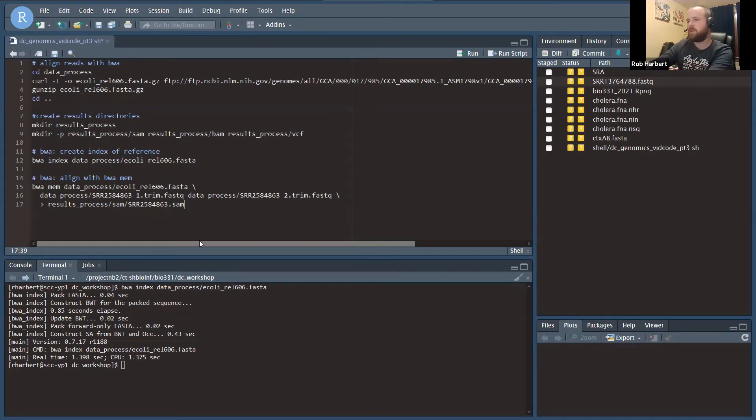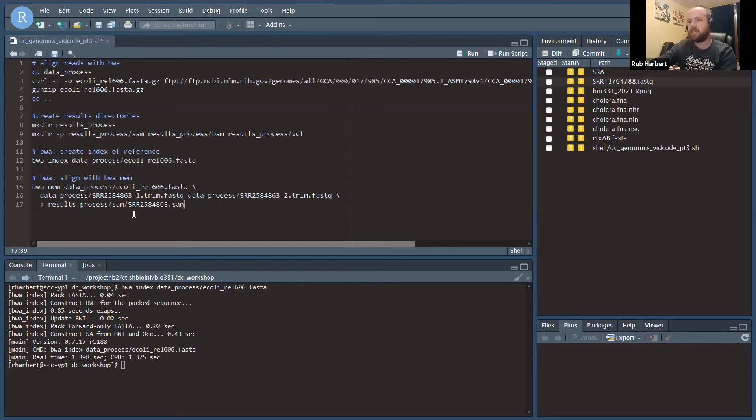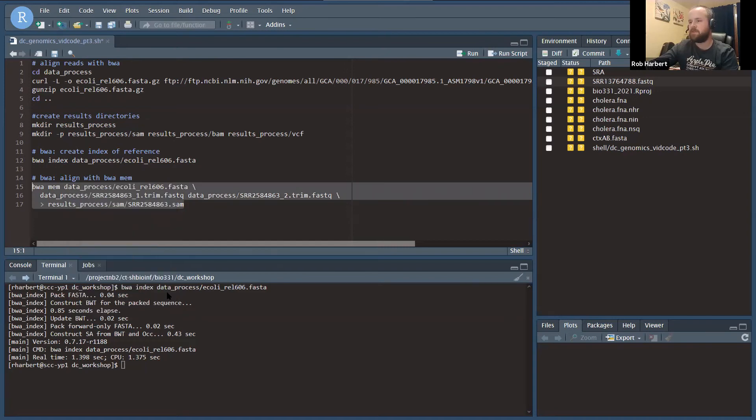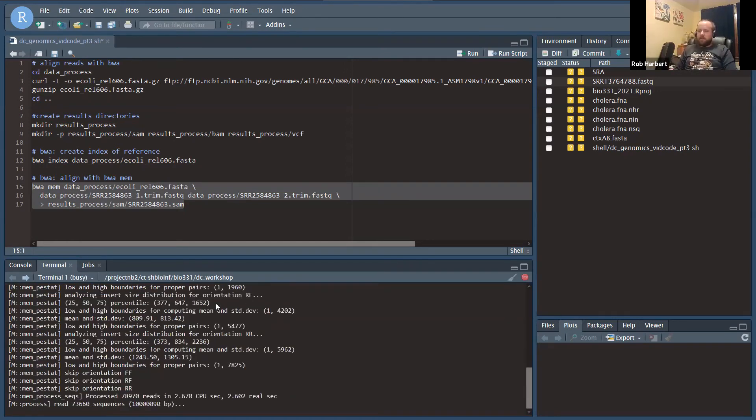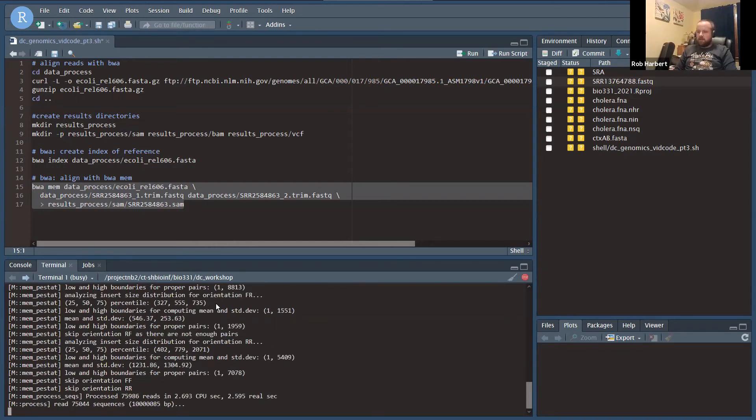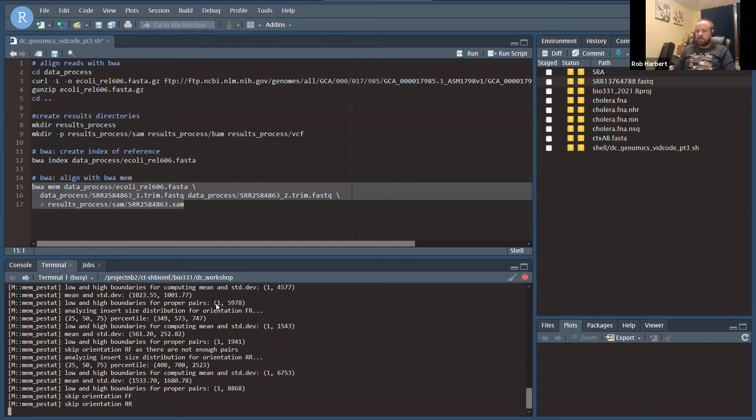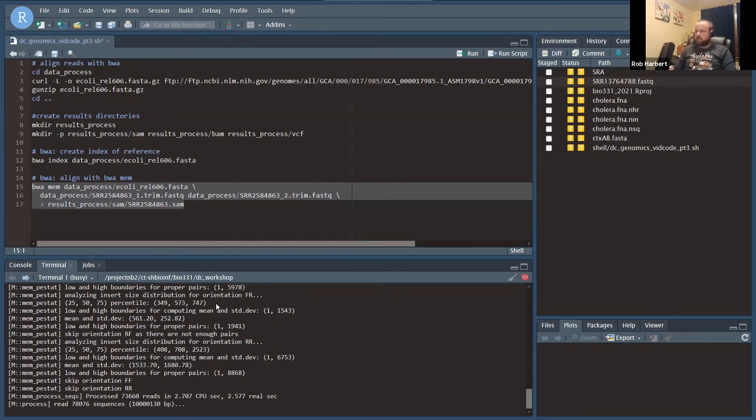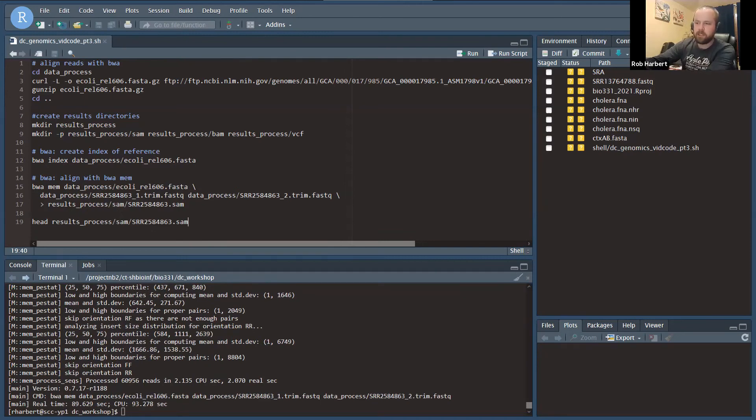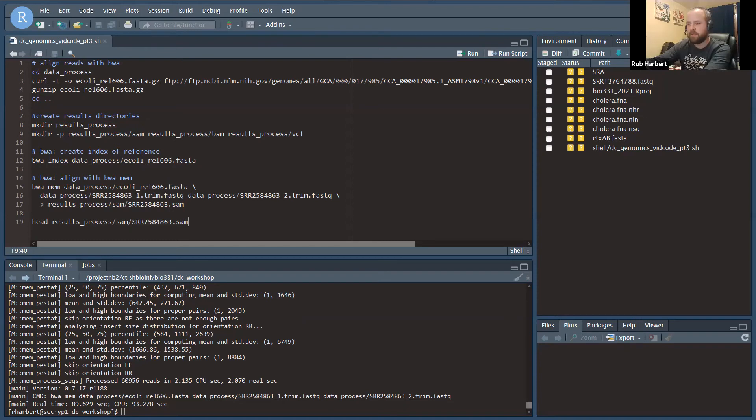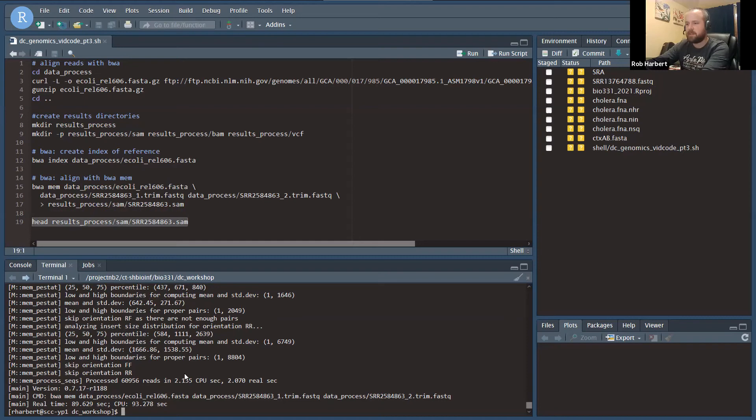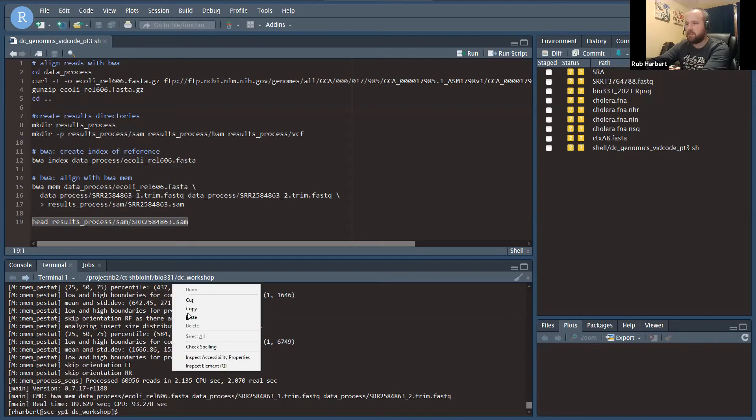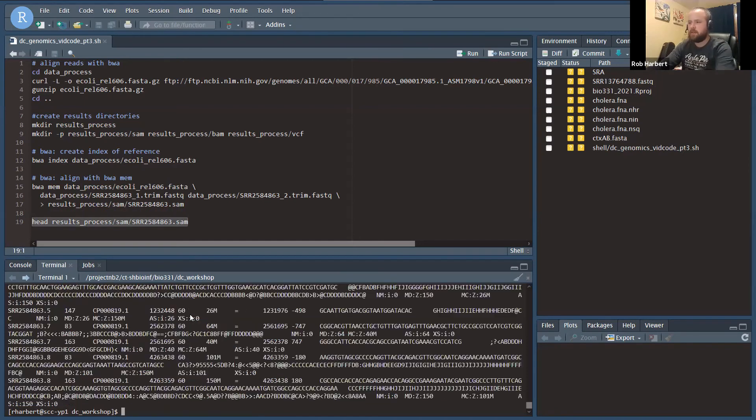This is going to run BWA. It's going to take every read in the 1.5 million or so reads in the 663 file and align it to the reference. It's going to output that alignment information in the SAM file format here in the results folder. BWA is fast, but even so, this is not a trivial search, so it's going to take a minute. There we go. In just about a minute and a half, we have aligned all of our reads to the reference genome, and now we should have a SAM file written.